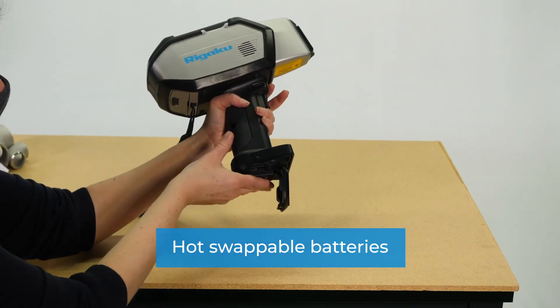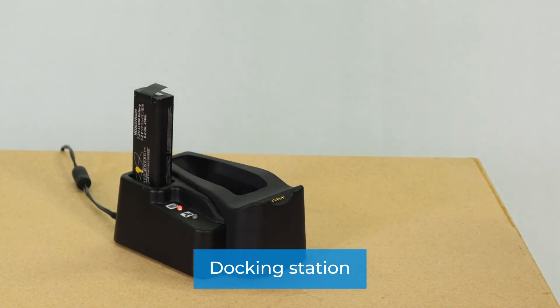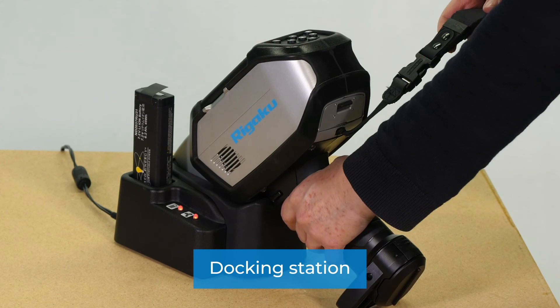Hot-swappable batteries for less downtime. Docking station — charge the auxiliary battery and keep your investment safe when not in use.